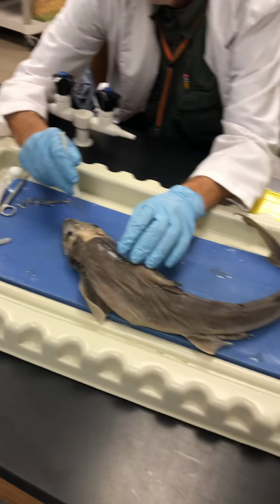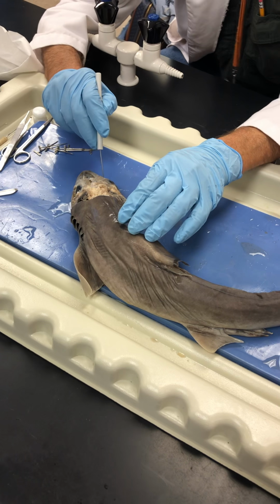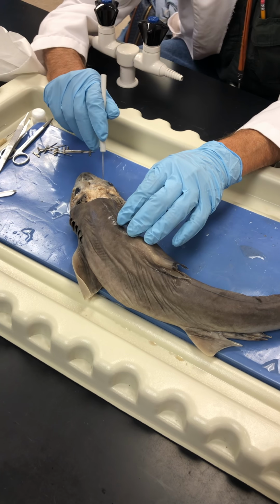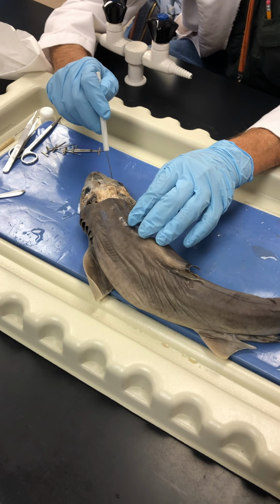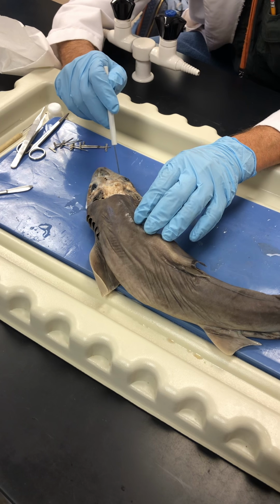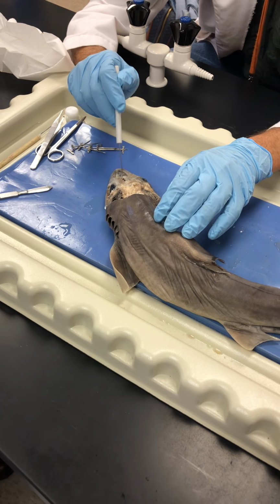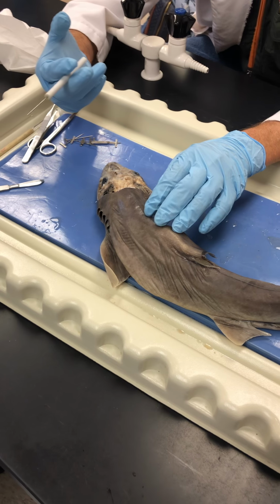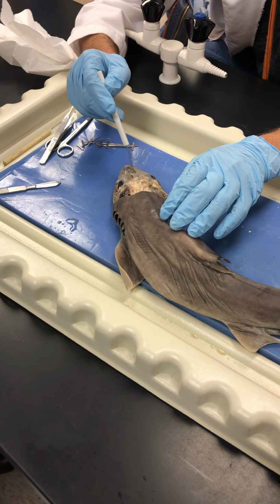Underneath here, which you're supposed to cut the cartilage away, you're going to find a grape-like structure. What's that grape-like structure called? Olfactory bulb. The olfactory bulb. And it's getting information from all these things here, in which it detects the chemistry of the water. Taste, smell, and all that.